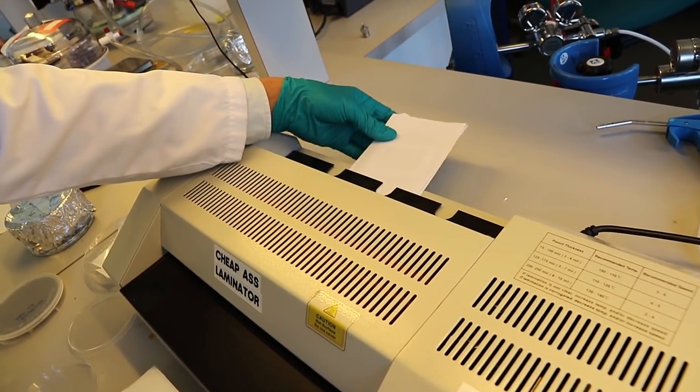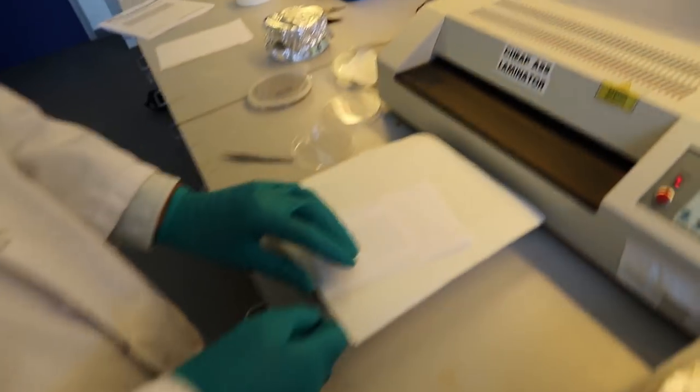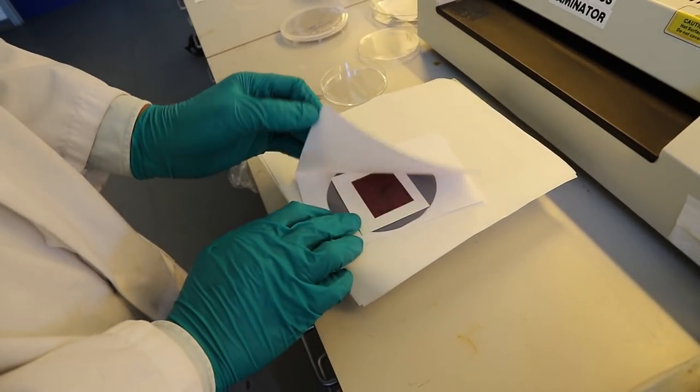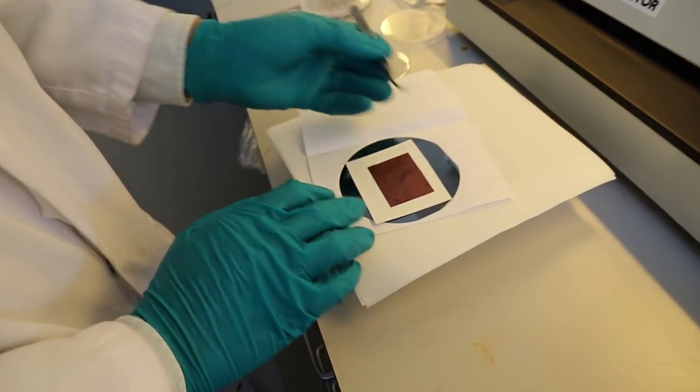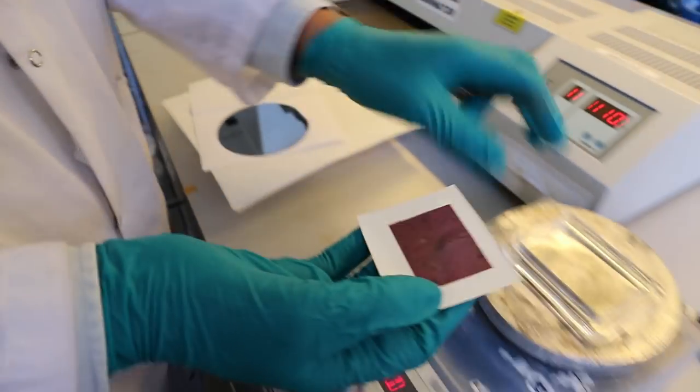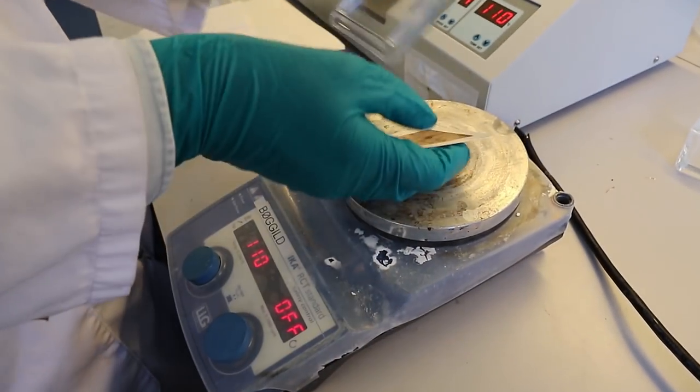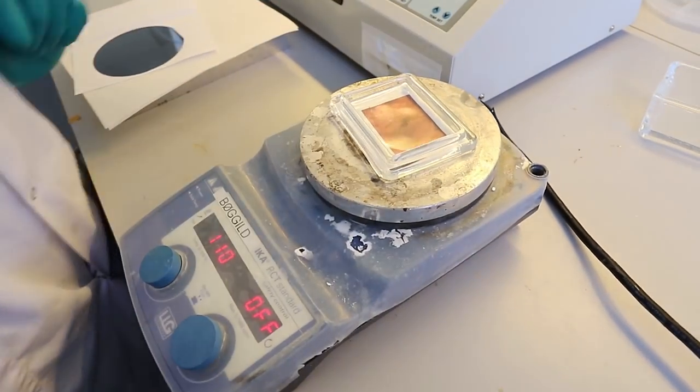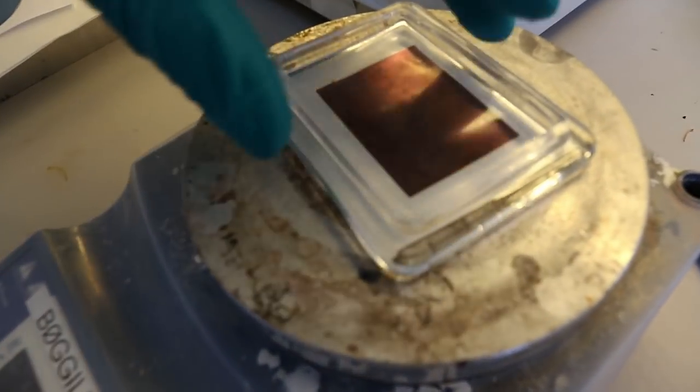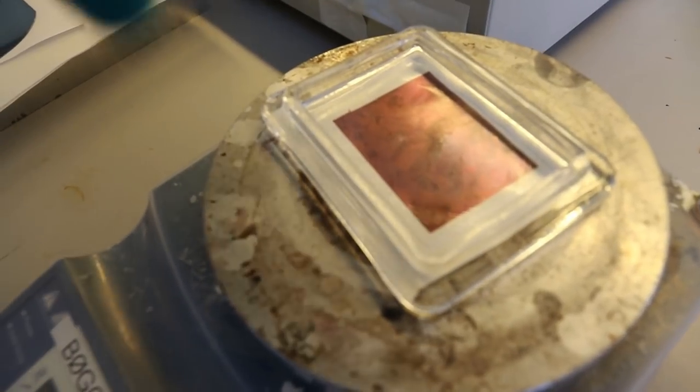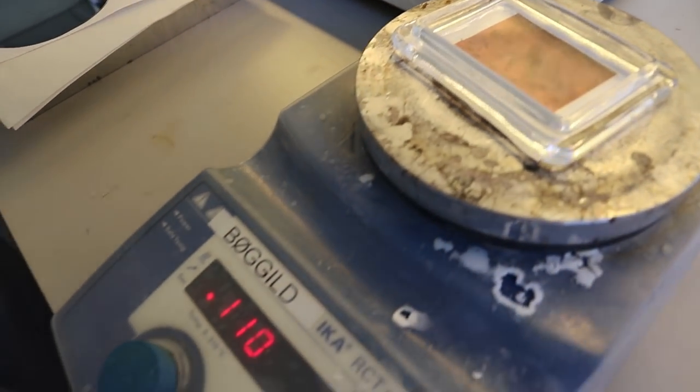Now we want to make sure that the copper is sticking properly to the PVA foil. So what we do is give it a little more bake on top of a hot plate which is at 110 degrees Celsius. We use this glass slide to push down the foil while it's getting heated.